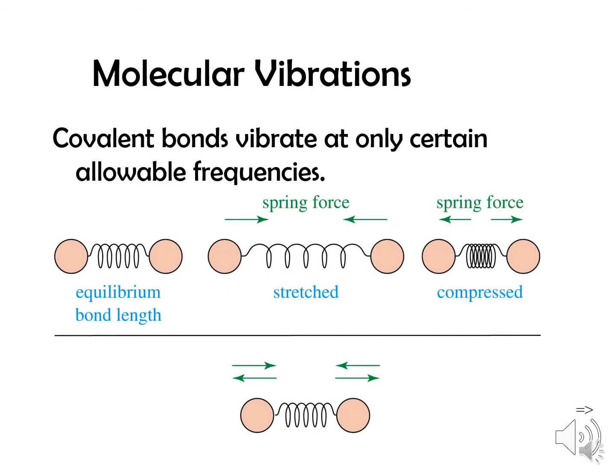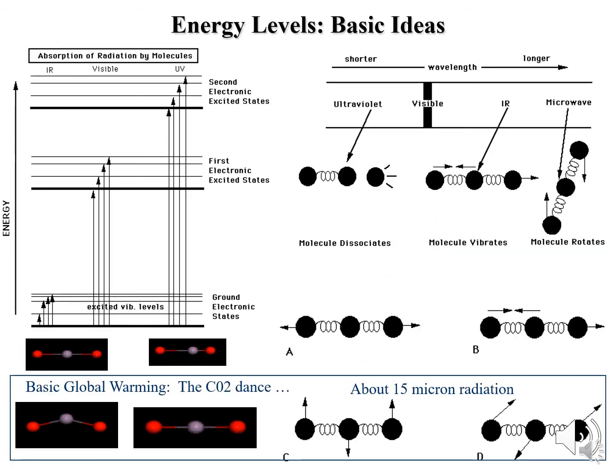And we're talking about molecular vibrations here. Covalent bonds vibrate at only certain allowable frequencies. That's according to quantum mechanics. And certain particular frequencies will correspond to absorptions if you're doing absorption infrared, or if you're heating up the molecule, it could be giving off that light, emission.